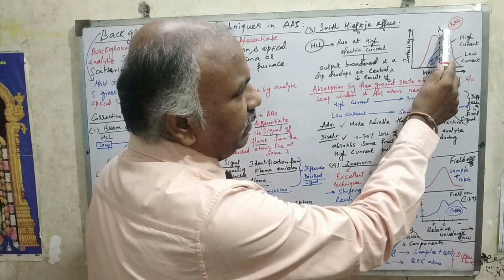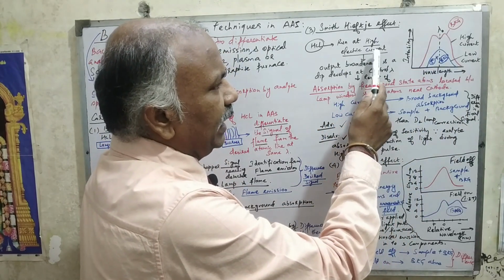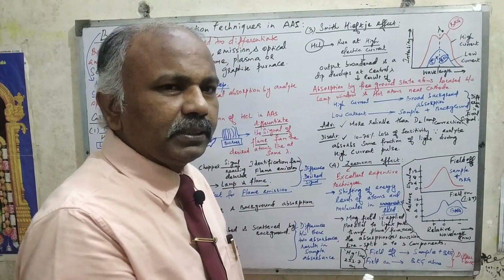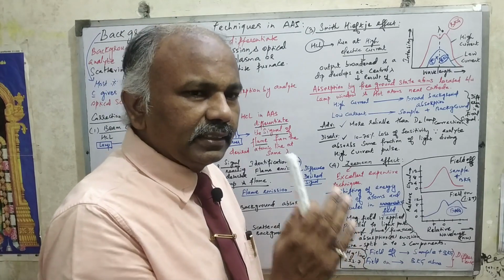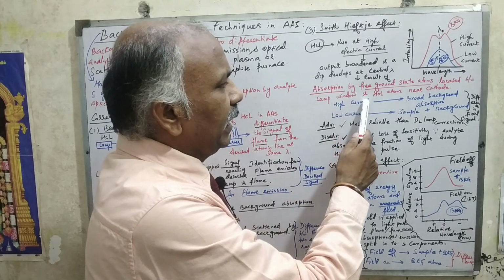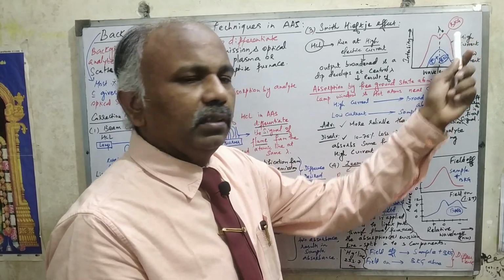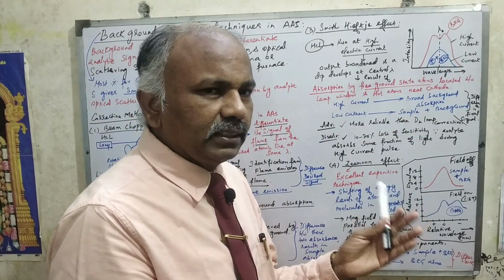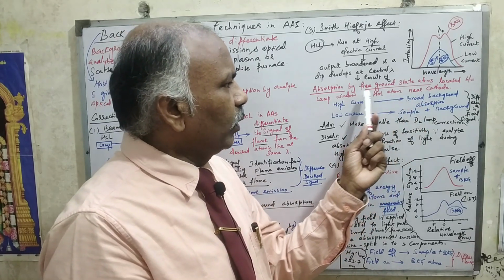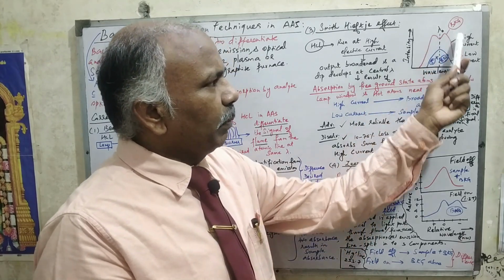There is a dip in the central region, right? The output is broadened, and the dip develops at the central wavelength, which is a result of absorption by the free ground state atoms located between the lamp window and the hot atoms near the cathode. That means it will give only the background. This is a very important aspect, right? So this is the property we are getting.